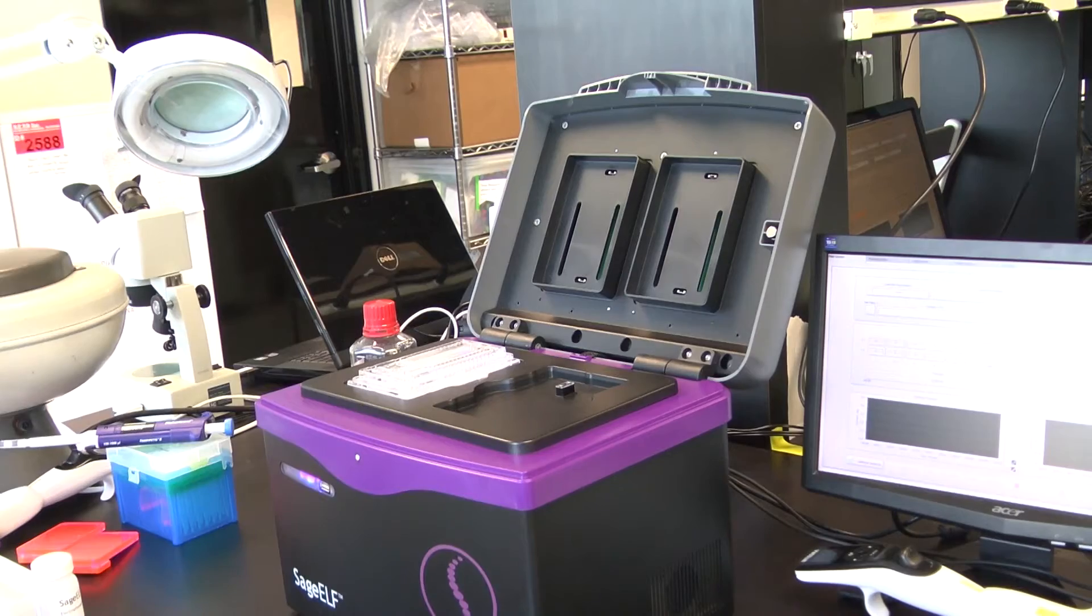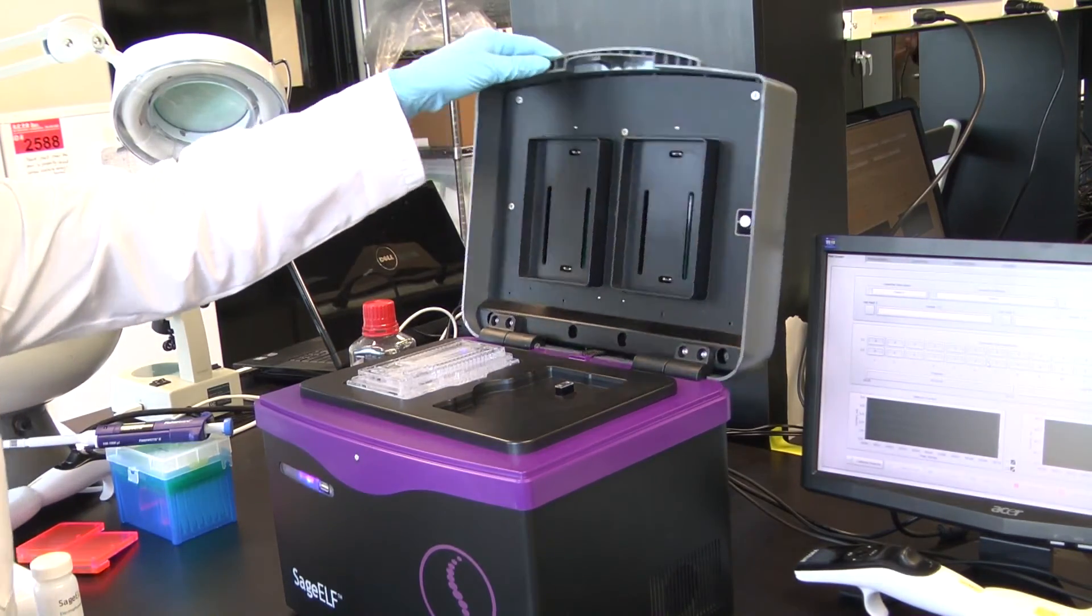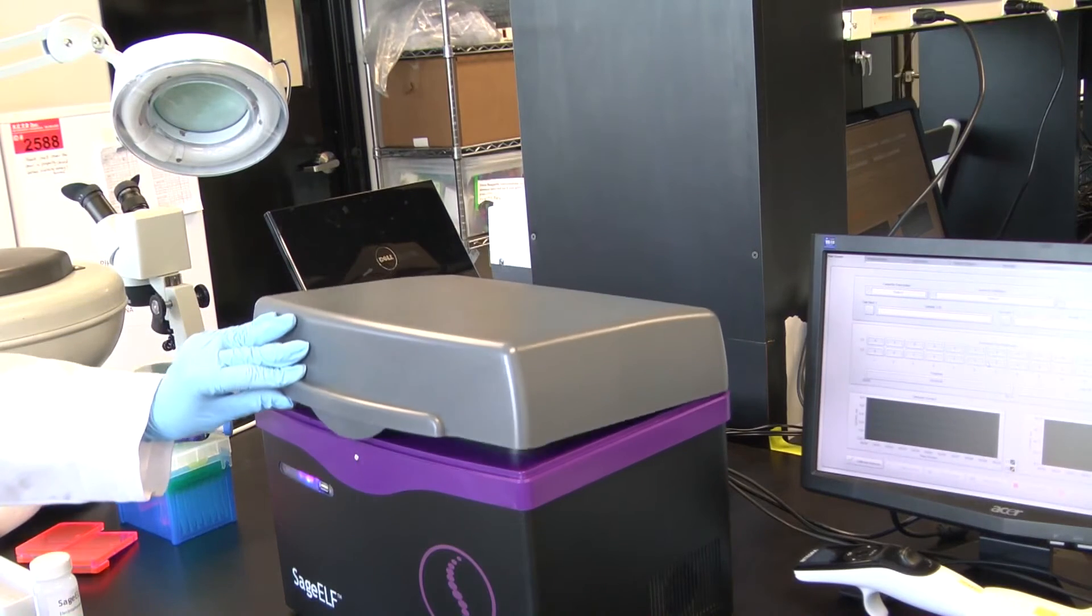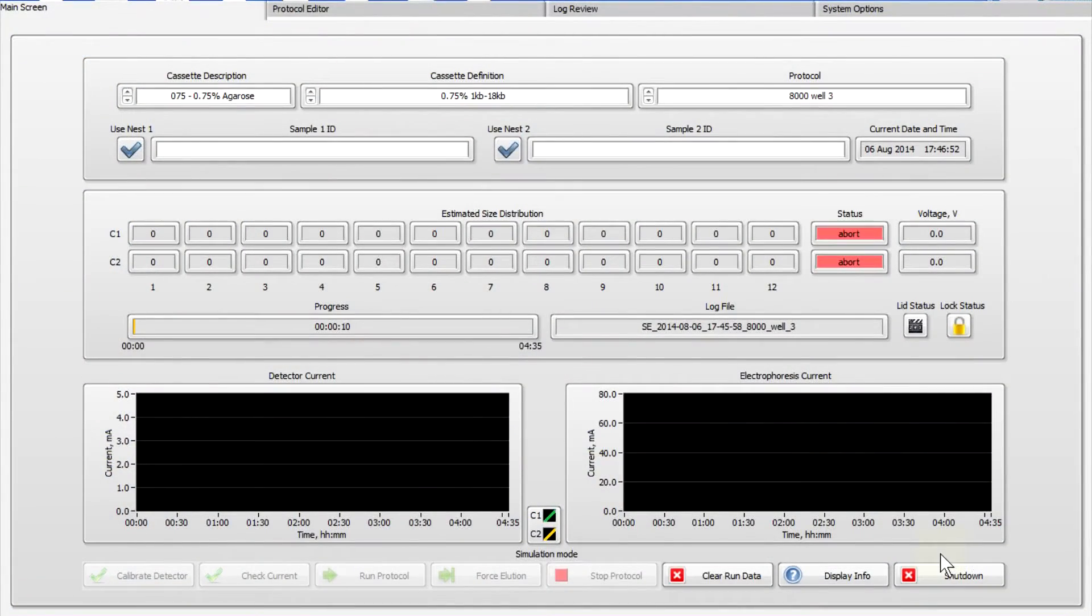Move on to the electrophoresis current test. Close the lid. Press the Clear Run Data button. Select the appropriate cassette description, cassette definition and protocol that will be run.